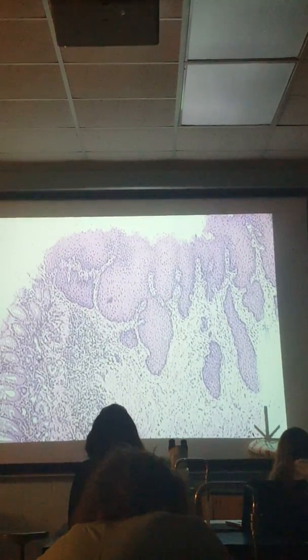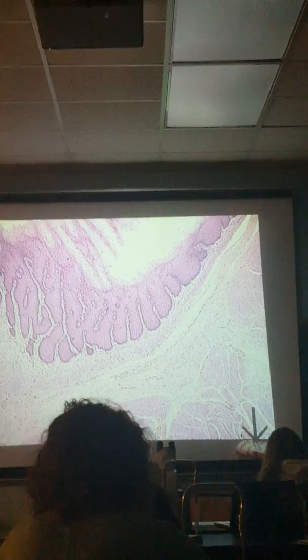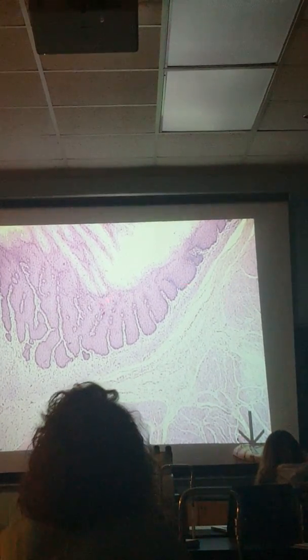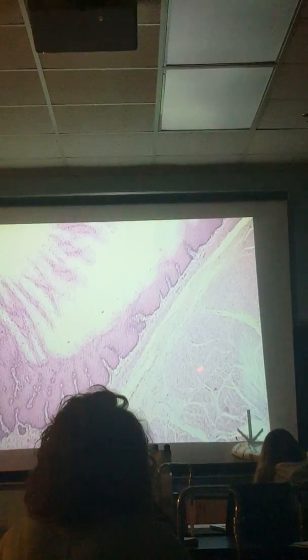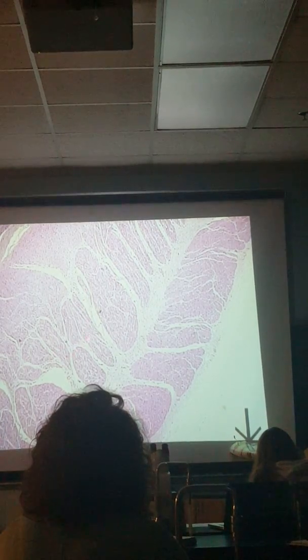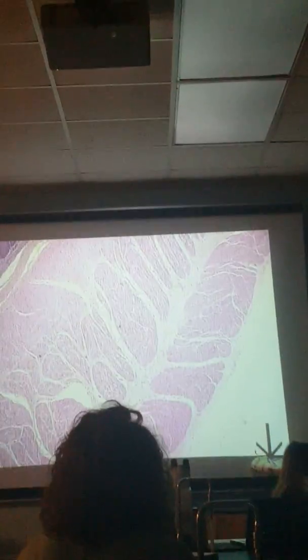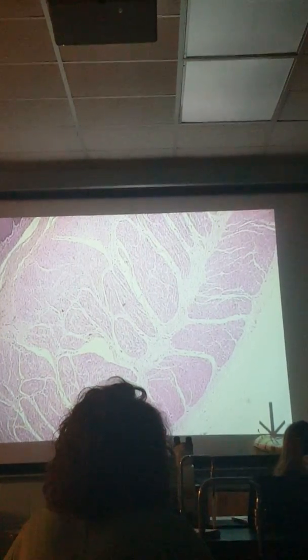What kind of muscle are we talking about now? Is it going to be skeletal or smooth muscle at this point? Entirely smooth muscle because we're in the bottom third of the esophagus. And then into stomach. Stomach is also entirely smooth muscle. So, you see those multiple layers. Mucosa, submucosa, muscularis externa. Nice, you can see the separation. So, inner circular, outer longitudinal, and then a bit of a serosa. Really nice split right through the two layers.